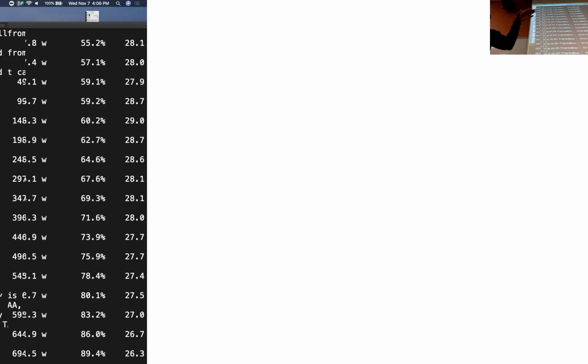So instead of just getting rid of everything, right? What people typically do is they just take the average read depth. If the average read depth is greater than 6, keep it. Well, the problem is an average is only an average, right? What if 30% of your genotypes are below 6? Or 30% of your genotypes are 1, but your average is 6. Well, 30% of your genotypes are going to be wrong because their read depth is 1, right?